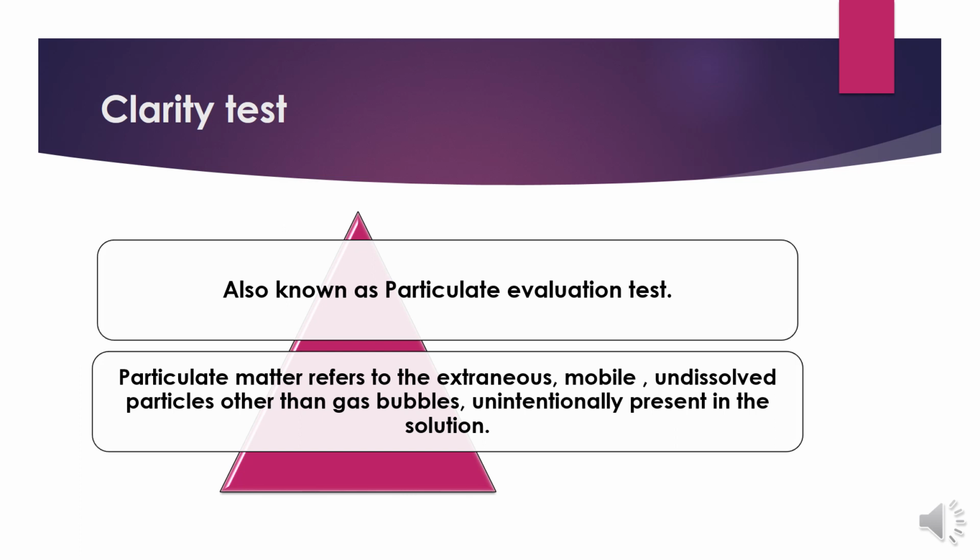The bubbles that are produced during mixing, shaking or preparation disappear after a short period of time, but particulate matter remains intact and undissolved. So they shouldn't be confused with those bubbles.